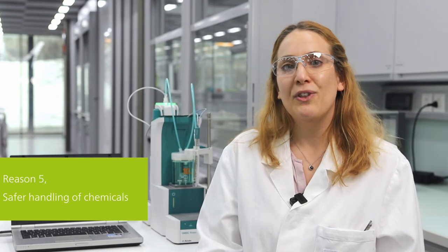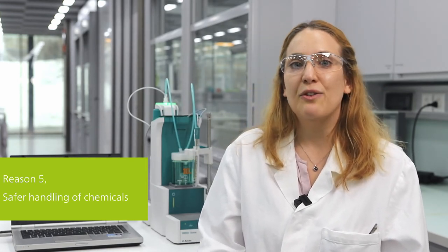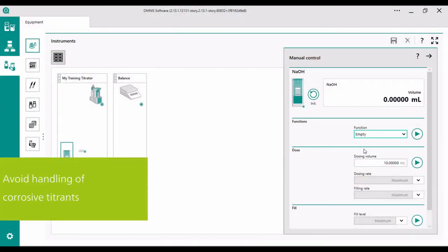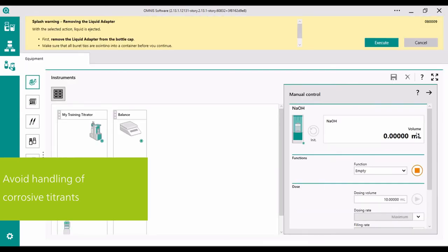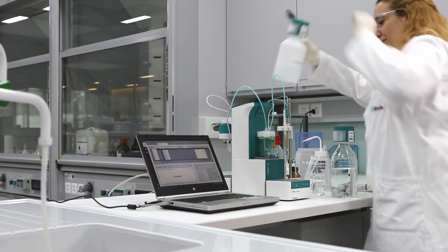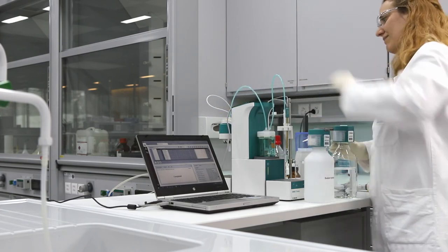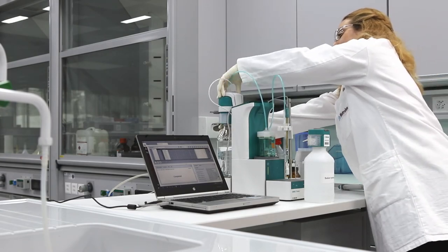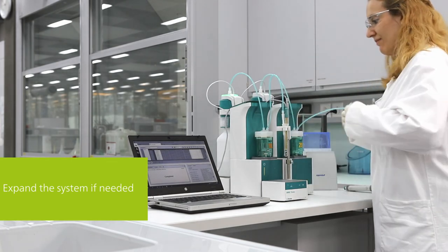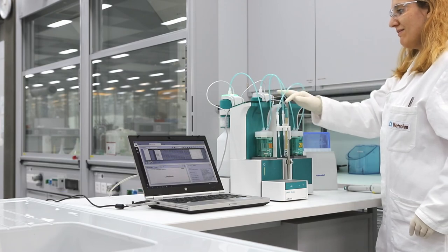My fifth and last reason for changing from manual to automatic titration is that handling of chemicals has become much safer. When you are done with the titration, you can empty the burette at the touch of a button — no exposure to corrosive or toxic chemicals. If you would like to use a different titrant, simply refill your burette with the new titrant after automatic rinsing. For more convenience, you may want to expand the system with an additional burette for a second titration or to add an auxiliary solution.